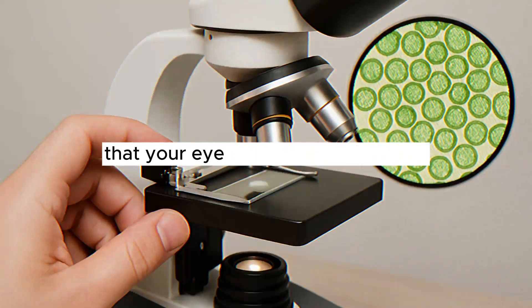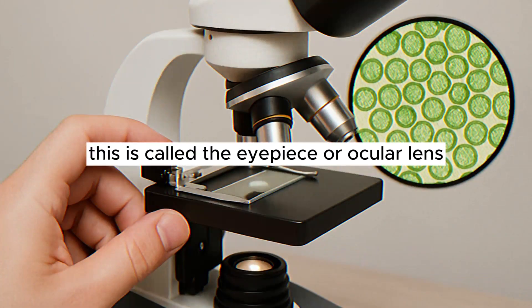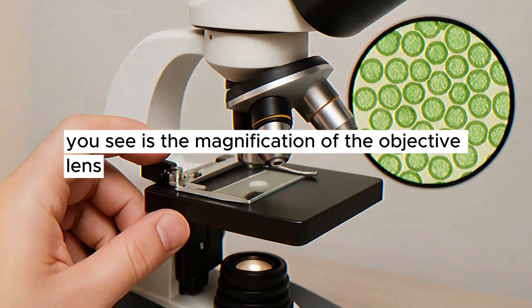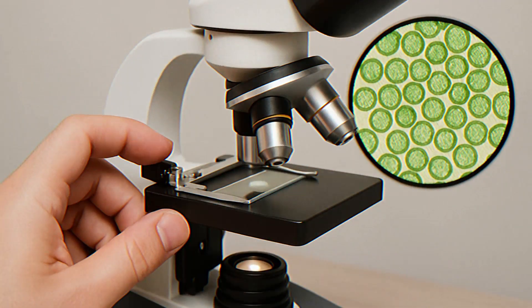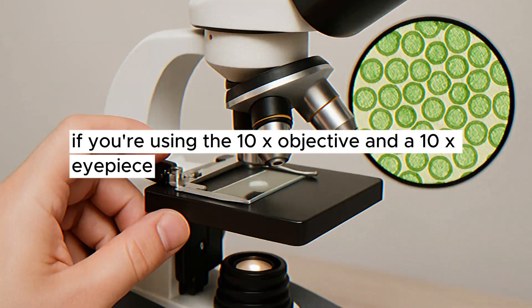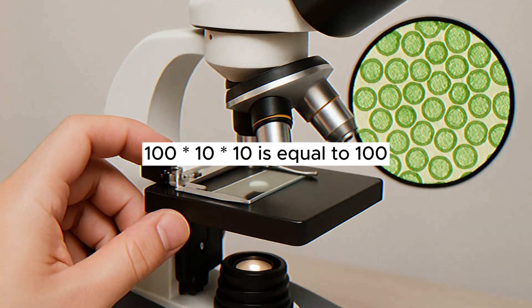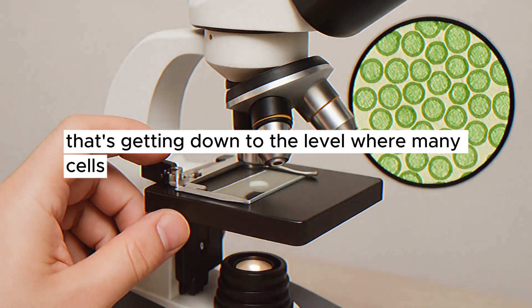Then, there's a second set of lenses that your eye actually looks through. This is called the eyepiece or ocular lens. The eyepiece usually magnifies the image another 10 times. So, the total magnification you see is the magnification of the objective lens multiplied by the magnification of the eyepiece. If you're using the 10x objective and a 10x eyepiece, you're seeing the object magnified 100 times. 10 times 10 equals 100. Switch to the 40x objective, and now you're at 400x magnification. That's getting down to the level where many cells become visible.